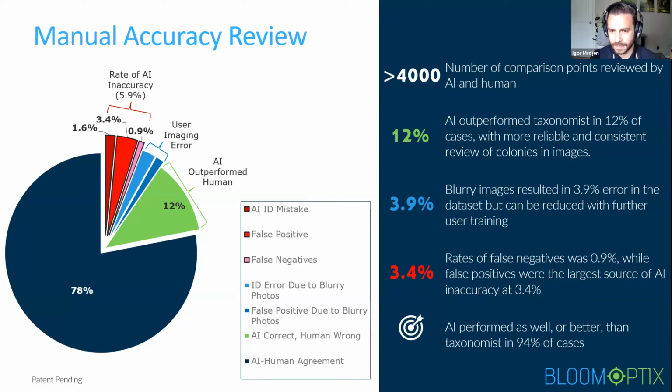And so the reason that this happened, what we found out was, over the course of an entire summer of processing 5,000 images by hand, and you can imagine how many colonies we had to label if only 500 of them had 4,000 colonies in our subset. Humans tend to make mistakes because humans are not meant for repetitive tasks that take a very long time and tend to be very boring.